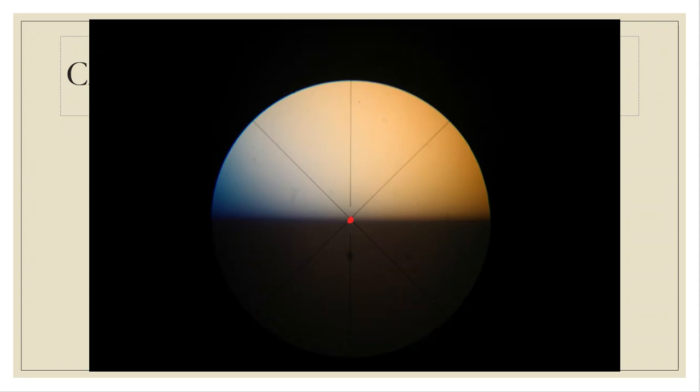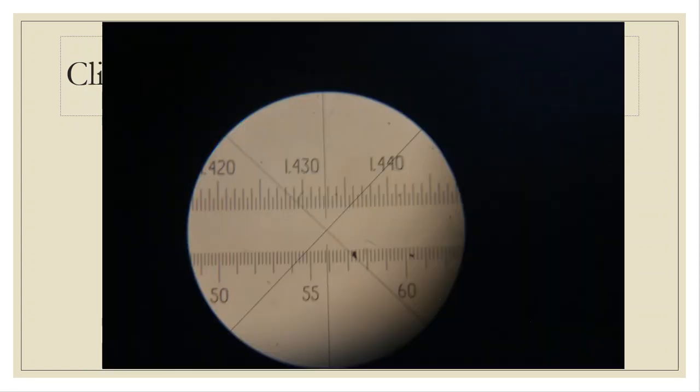Then I take that flip switch and I push down. And when I do that, this is the meter that shows up. All right, so how do we read this number? Well, this is 1.430. This is 431, 432, 433, 434, 435. That would be 436, 437, 438, 439, 440. So those are what the taller lines mean on that meter.